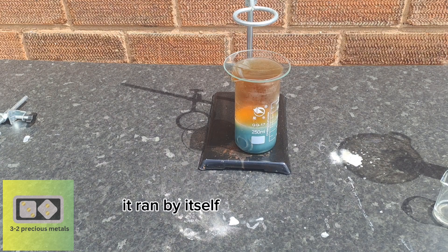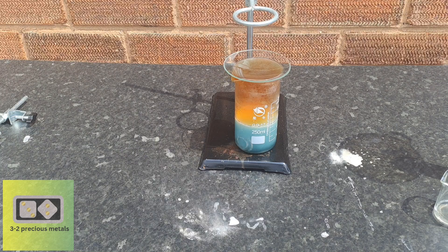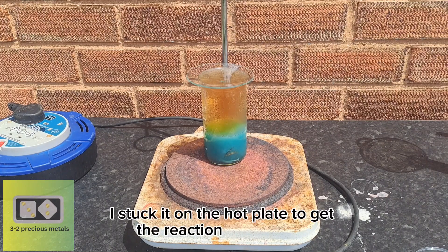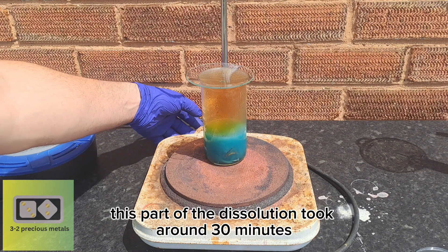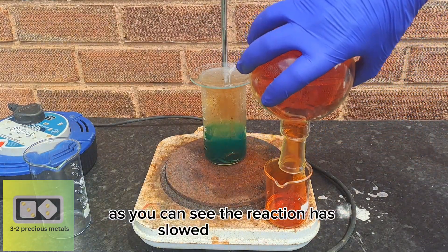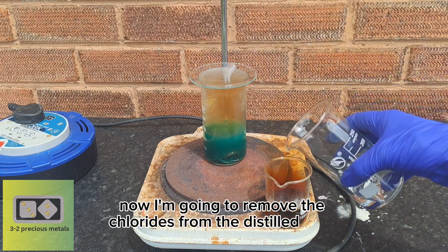It ran by itself for around 45 minutes before I needed to add any heat. Once the reaction slowed, I put it on the hot plate to get the reaction going again. This part of the dissolution took around 30 minutes. As you can see, the reaction has slowed right down, so now I'm going to remove the chlorides from the distilled nitric acid.